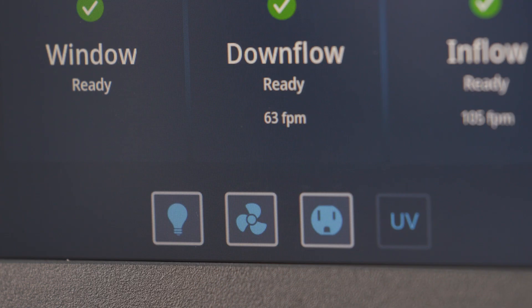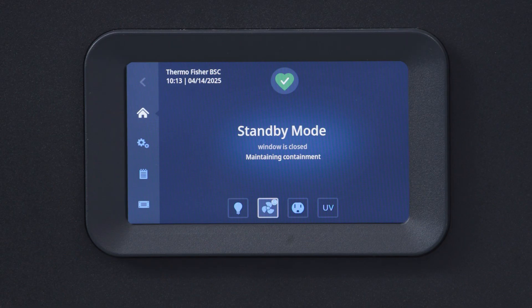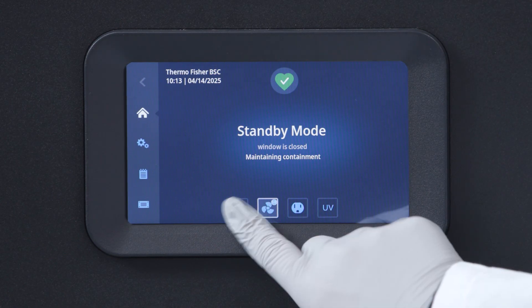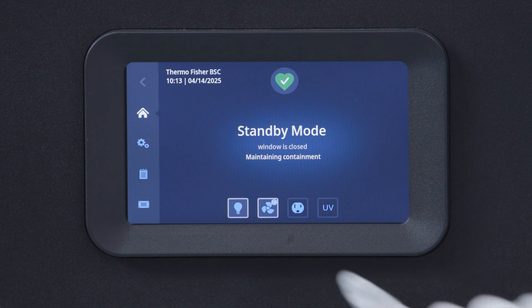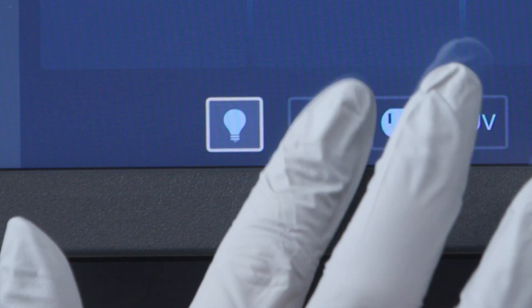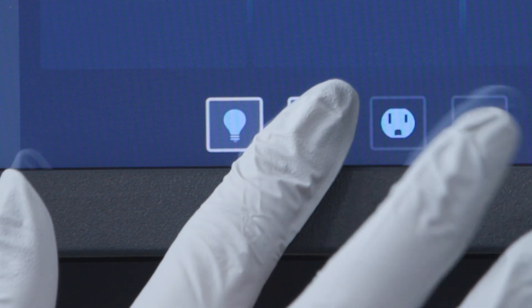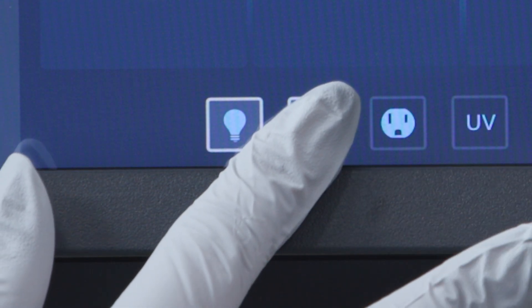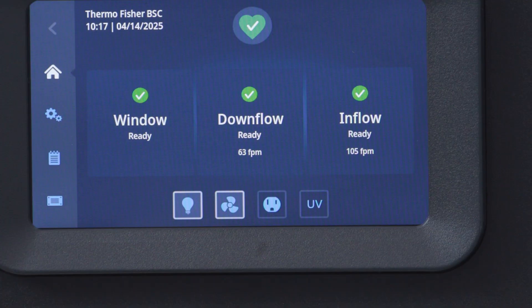Notice the control icons that run across the bottom. When we press the icon to energize the light, notice that the white border will illuminate. Next, look at the fan icon — touch it to turn on the fan and see that the border turns white as well.